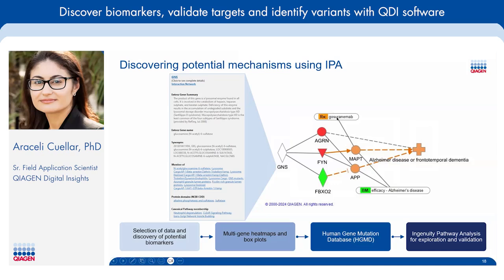In addition to building a network, you can take a look at your gene and get further insights and see, what is the gene about? What is it a member of? And then what particular pathways this gene is involved in.